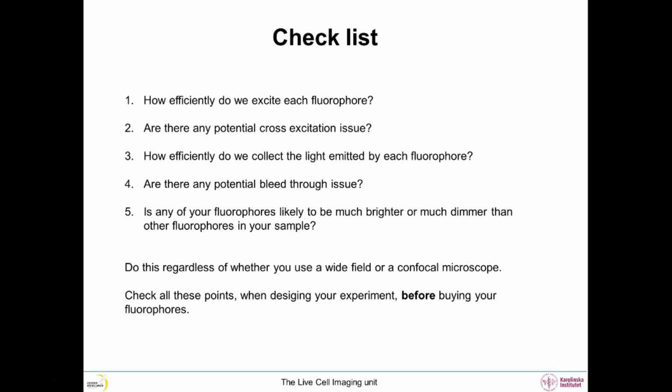Check all these points when designing your experiment before buying your fluorophores.